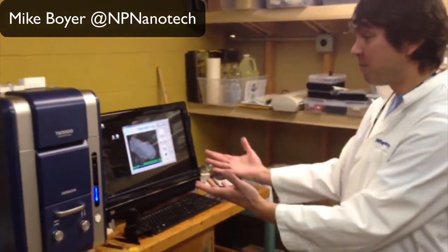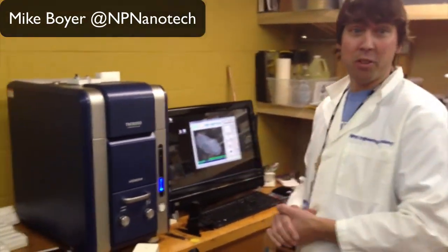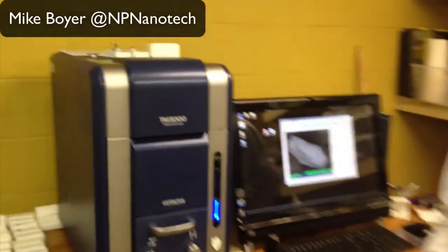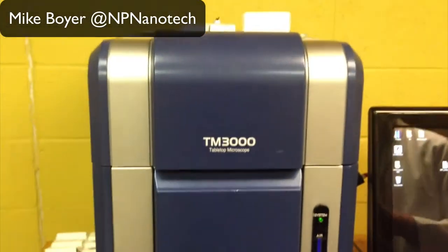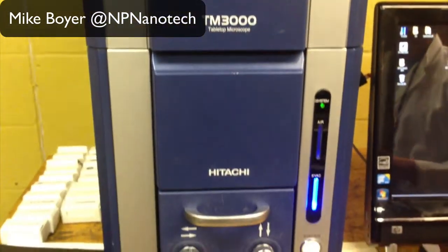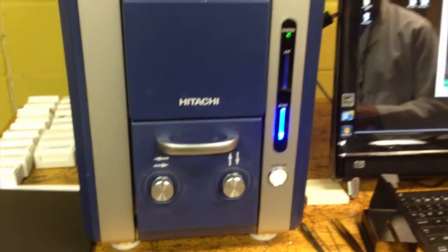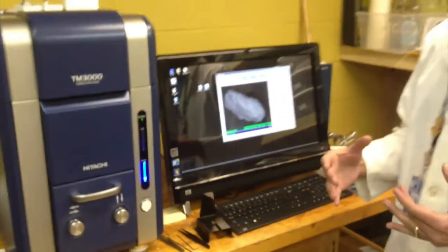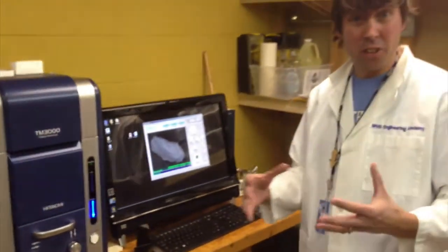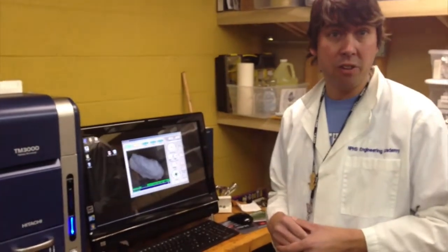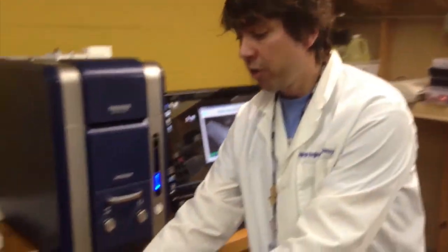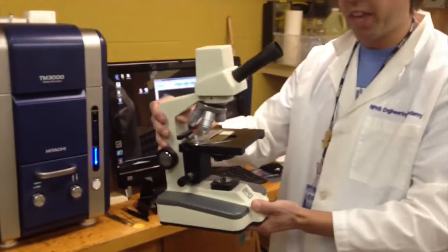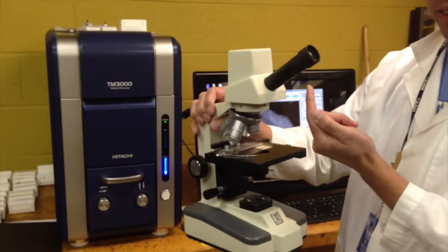This is called a scanning electron microscope. It sounds kind of complicated, but when you get to the basics of what it does, it's amazing. It's an amazing tool that scientists and engineers use to analyze materials at a very high magnification. With traditional microscopes you may have seen before, they use light — light shines up through a series of lenses and gets magnified so when you look through, you can see the sample.